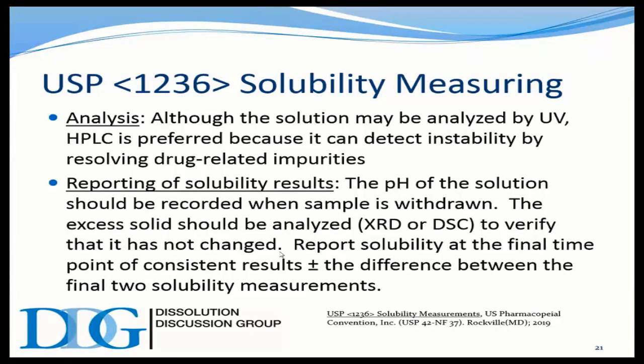So in other words, as this is approaching saturation, this process is slowing down. It's going to take maybe an extra day or two to get that last bit into solution to truly understand the thermodynamic equilibrium. And the way I relate this is like drying something to a constant weight. You just want to make sure your final two solubility measurements are the same.